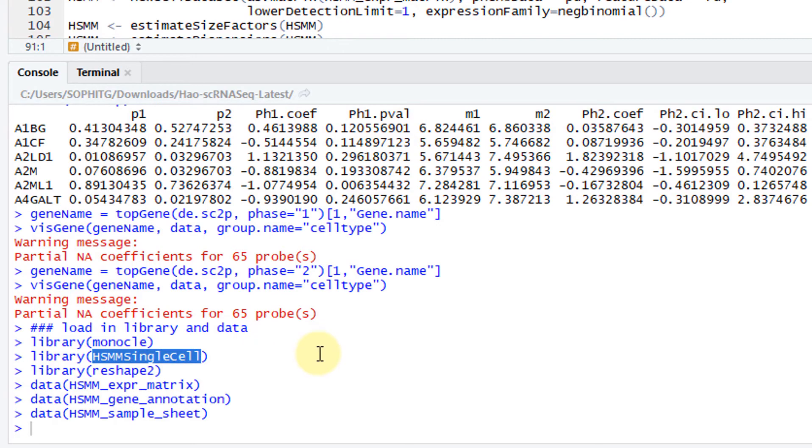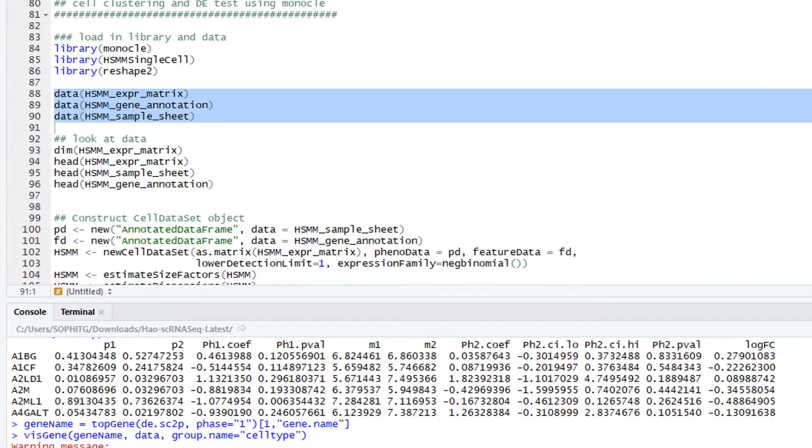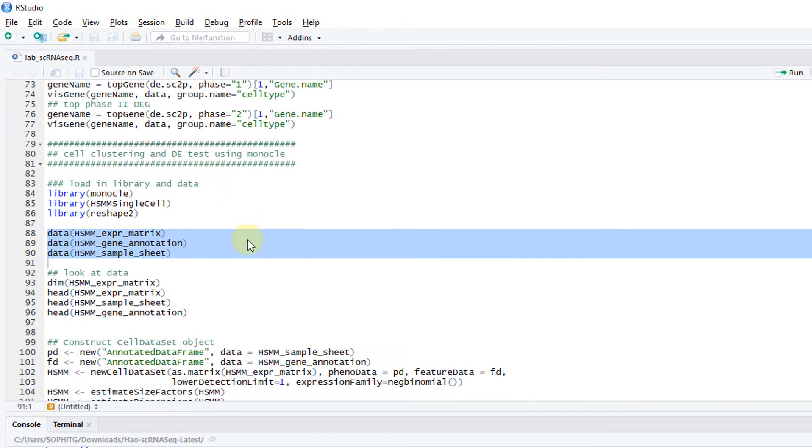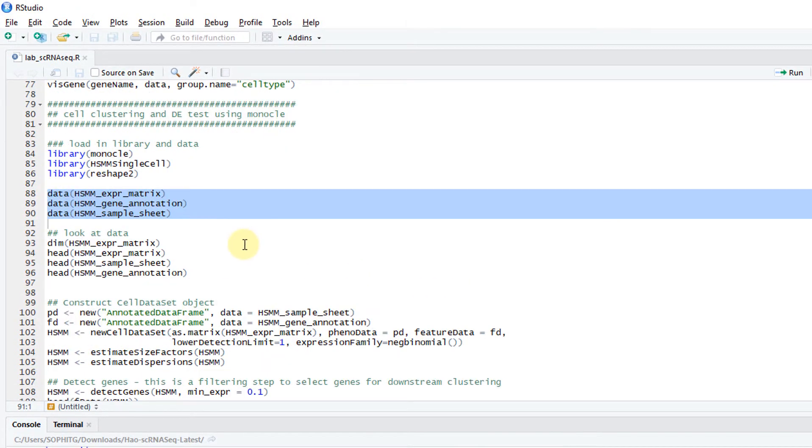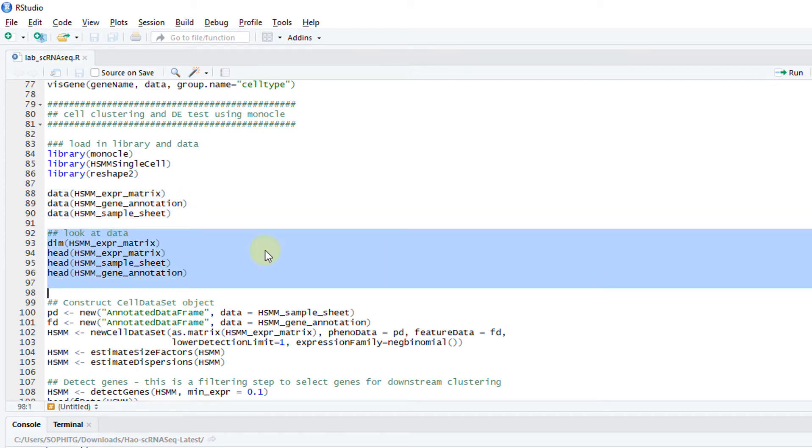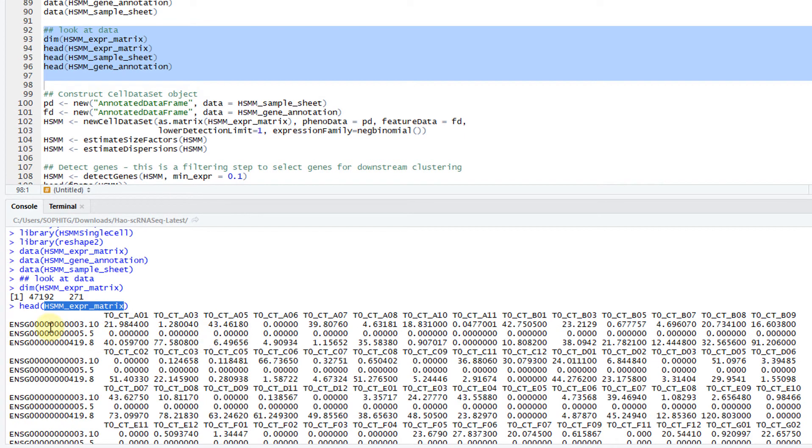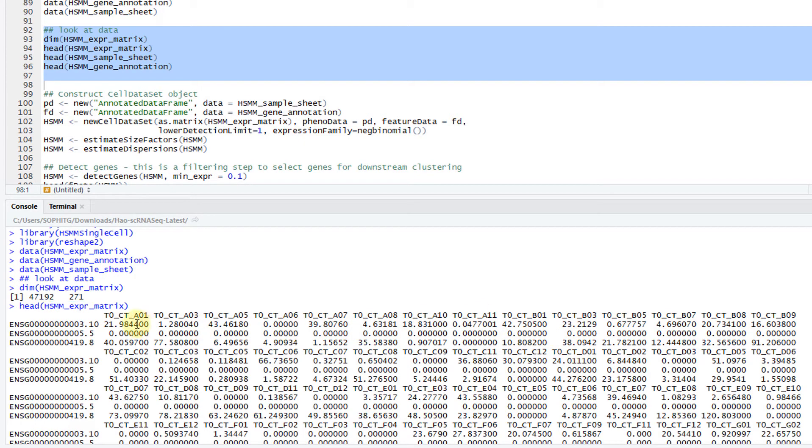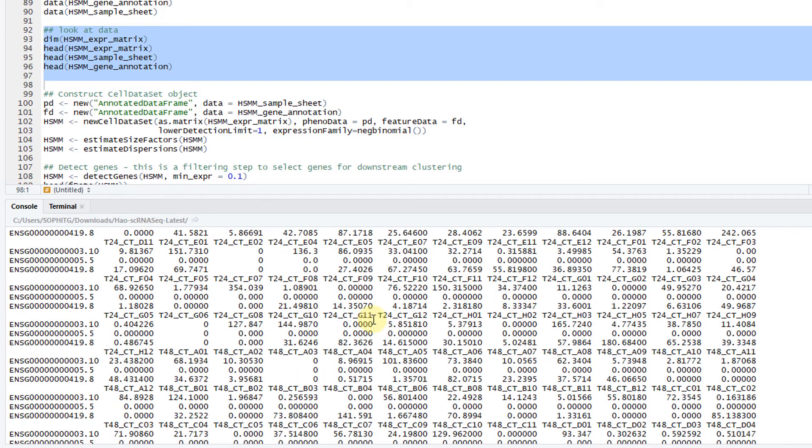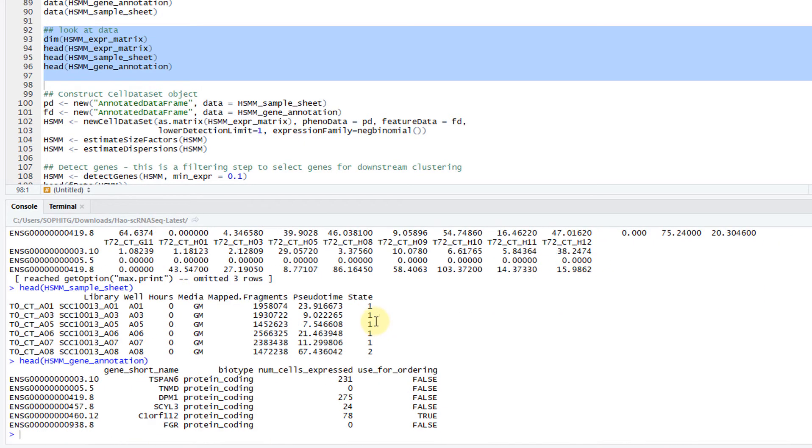Those are the example data distributed with Monocle. It's actually distributed with this package. But it's also accompanied with Monocle. Let's take a look at the data. This is the expression matrix. Each row is a gene. Each column is a cell. These are the TPM values.